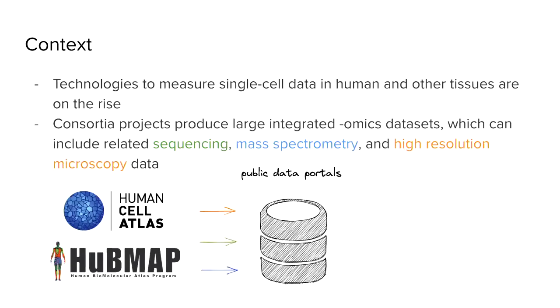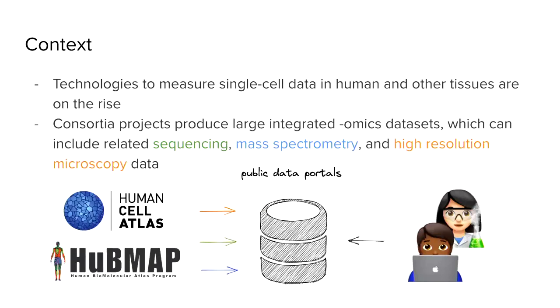And as a part of the Gehlenborg Lab, we were tasked, on a larger team within HuBMAP, to build out infrastructure for the public data portals. These data portals are very important entry points for scientists and individuals to preview and explore these growing tissue atlases. So we have to think a lot about the visualization, but also about the infrastructure that can support browsing these growing data sets.